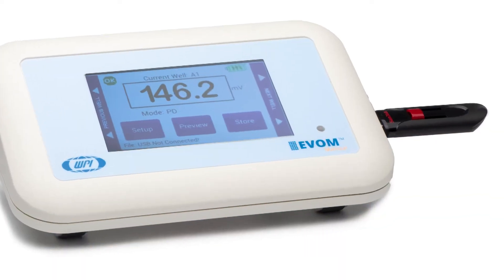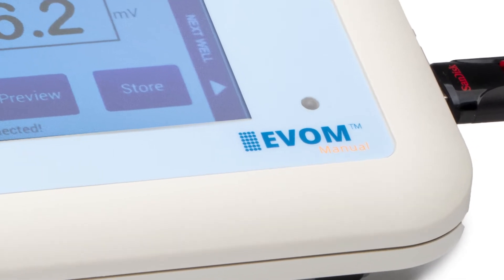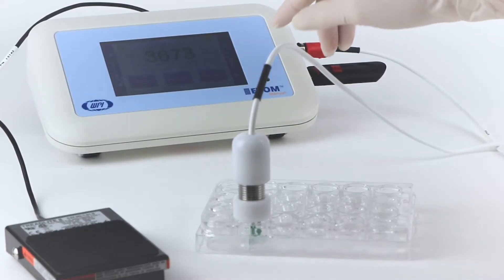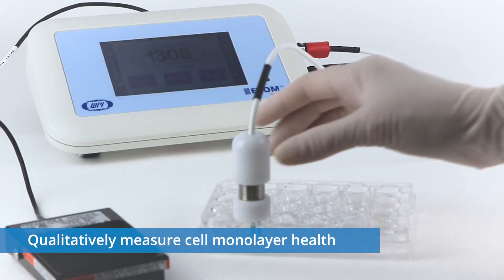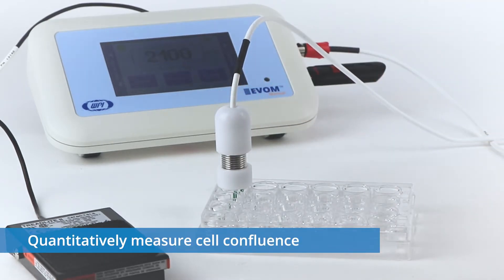WPI's EVAM technology is the gold standard for delivering stable and repeatable trans-epithelial electrical resistance measurements. Here are nine reasons to trust the new EVAM Manual Tier Meter for qualitatively measuring cell monolayer health and quantitatively measuring cellular confluence.